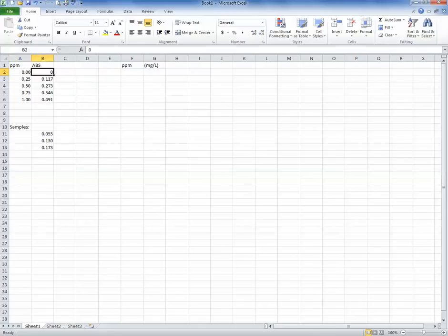All right, so the absorbance here, I want to show that one as well with 3 decimal places. It's probably what shows up on my report or my instrument, so I want to represent that in the spreadsheet for significant figure purposes, right? Okay, so once I scanned maybe my highest standard, I found the wavelength, and that wavelength I believe in the previous videos was like 571 or 573, somewhere in there.